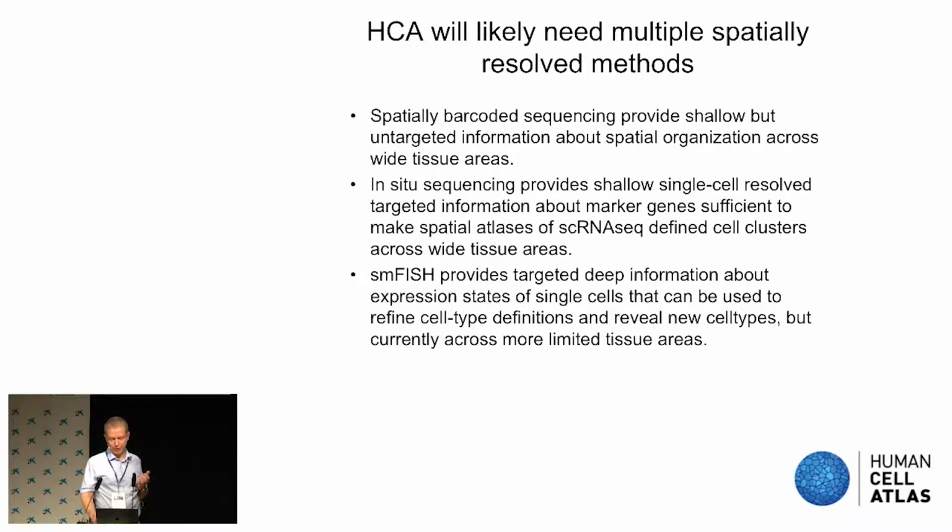While single molecule FISH provides very deep information about the expression states of single cells, and which can be used to refine cell type definitions and even reveal new cell types. But currently, with the heavy imaging needed, it's sort of limited to relatively small tissue areas.